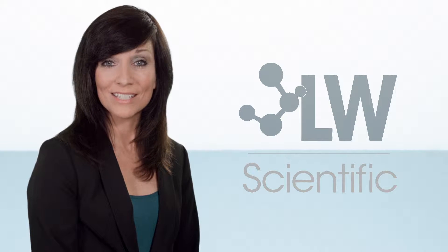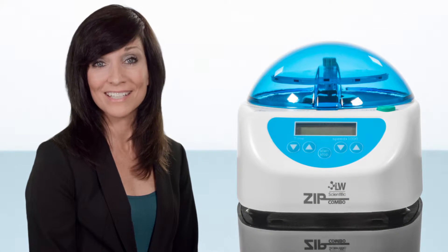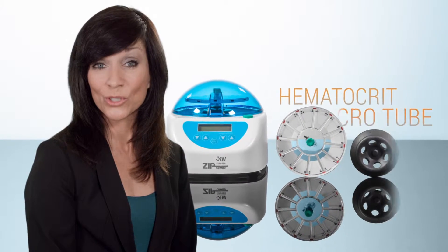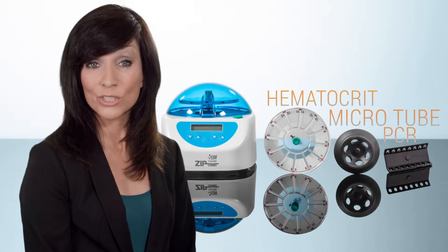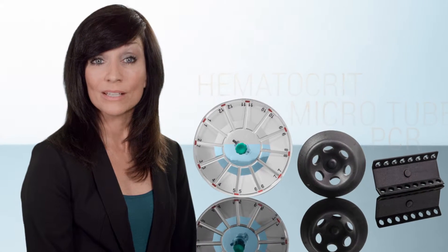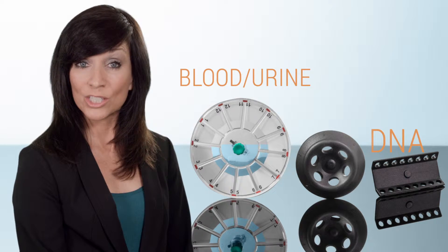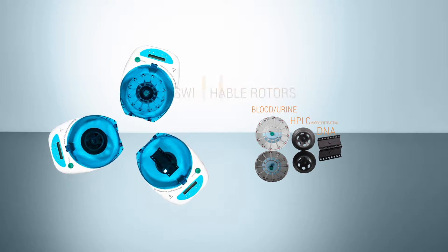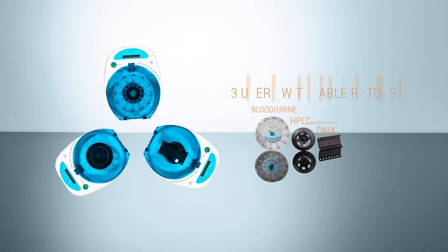The LW Scientific Zip Combo Centrifuge is designed to custom fit around your laboratory's specific needs. Housing interchangeable hematocrit, microtube, and PCR rotors, this centrifuge is ideally suited for a multitude of tests, including blood, urine, DNA separation, and HPLC microfiltration. This modifiable centrifuge will increase testing potential and decrease your lab's workspace footprint.